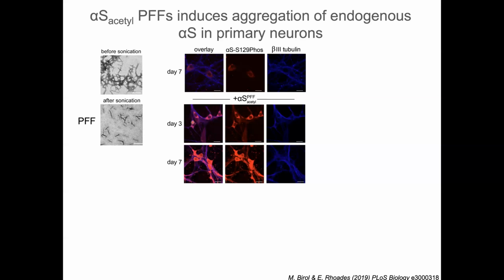And so in this model system, what we're trying to do is look at internalization of these alpha-synuclein aggregates by these primary neurons. This first image is day 7 post-culture, the time where we added synuclein to our non-control cells. What we're staining for here in blue is just tubulin, so you can see where the cell outline is. And then in red, we're staining for this phosphoserine 129 alpha-synuclein. This phosphoserine 129 is just a modification on synuclein that is upregulated. You find more of it present as the synuclein begins to aggregate. So it's our way to look at our amount of synuclein aggregate.